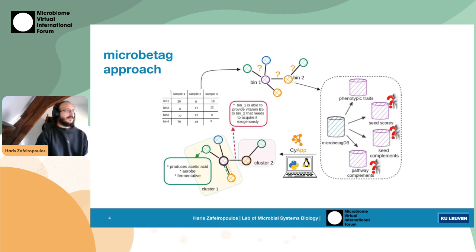Let's say in the first place, we had to come up with a whole process that you can see in this figure, more or less. That you start, of course, from your abundance table to create your co-occurrence network. So far, so good. This is what is common to do.